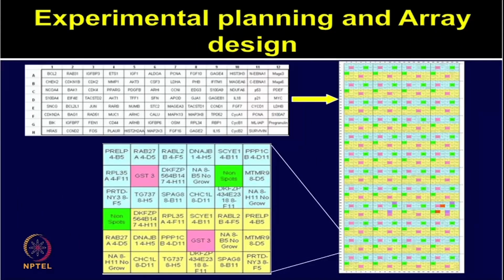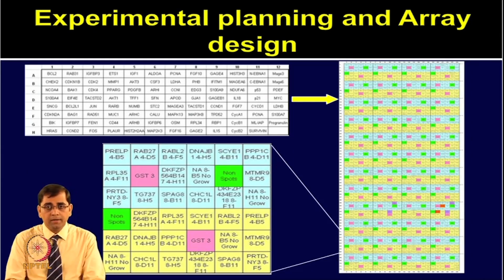For example, I have shown you a few insets here. The very top panel in these slides shows different genes which you would like to make on the 96 well plate while doing DNA prepping. First of all, you have clones and now you want to do the DNA prepping. You know in each well, for example in A1, what gene it would contain.